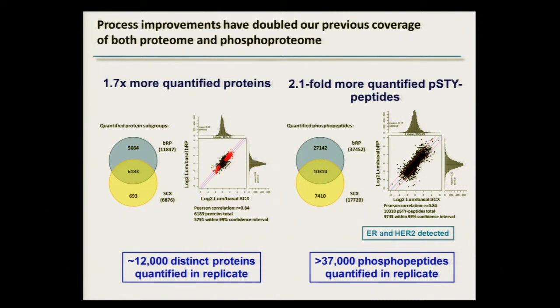If you can't do that, you always have to be aware, when you analyze your data, that those differences might occur. For example, problems with iTRAQ labeling are that peptides can get oxidized on methionine residues, so you might have differential oxidation of those peptides, and those peptides might be strongly regulated between biological states, and you just have to analyze then the oxidized and the non-oxidized versions.